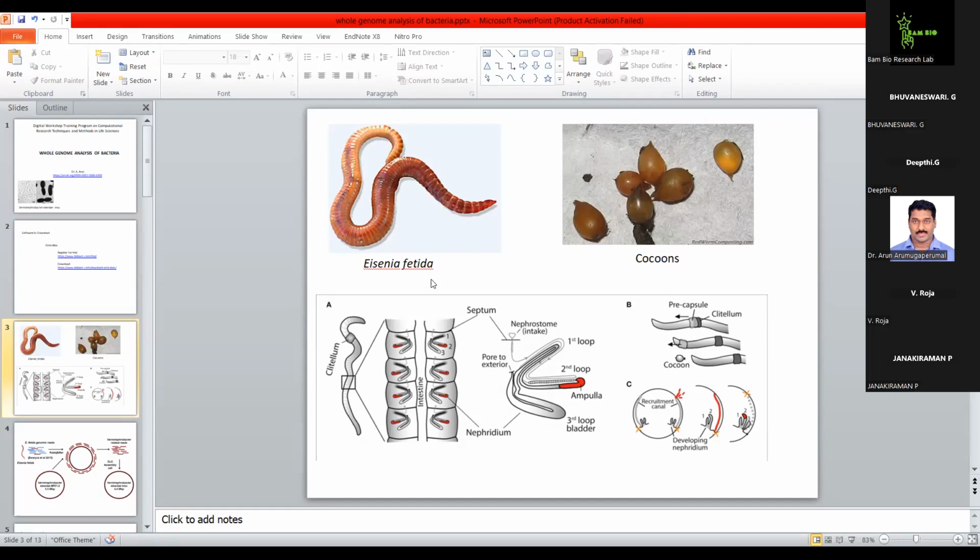As you very well know about the Sanger dideoxy method, now recent methods called next generation sequencing have very sophisticated instruments which automate the Sanger dideoxy method of sequencing. So you have various platforms like Illumina, Ion Torrent, Pacific Biosciences, and so on. Each technology uses its own process to sequence the DNA pieces, and each of them has its own limitations. From there you get the DNA sequence, and then you can analyze it to get meaningful information.